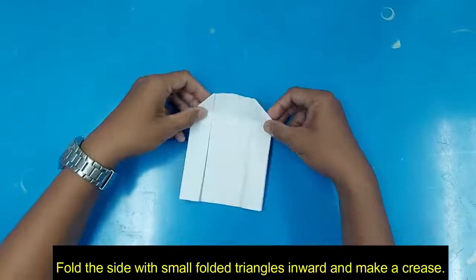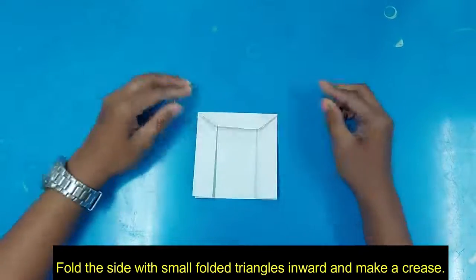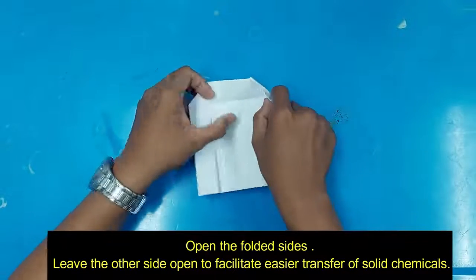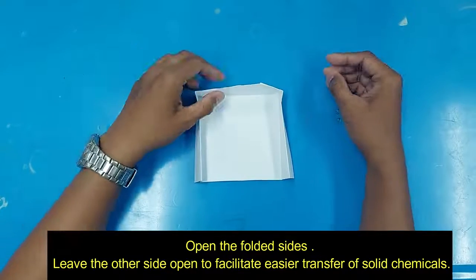Fold the side with the small folded triangles inward and make a crease. Open the folded sides. Leave the other side open to facilitate easier transfer of solid chemicals.